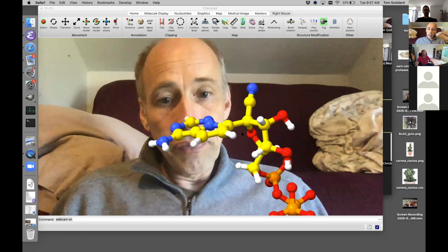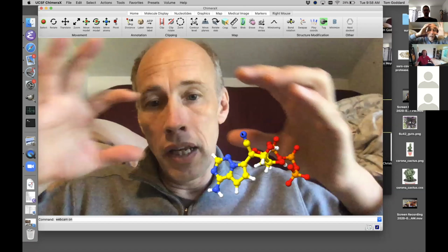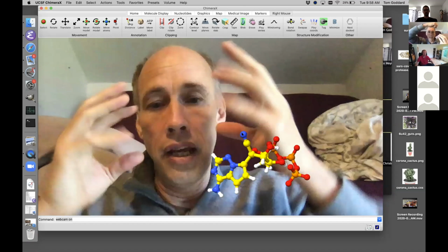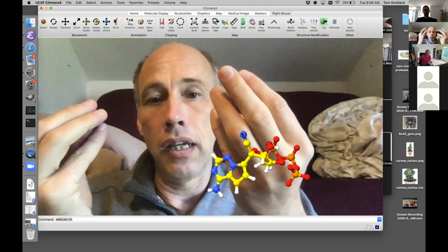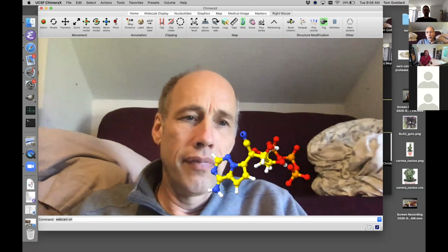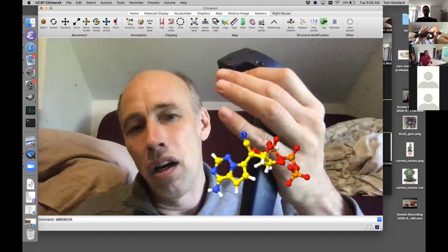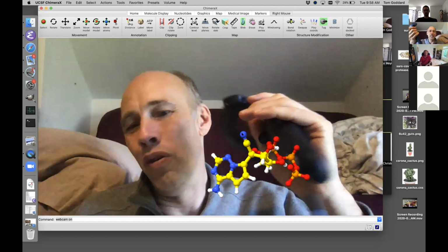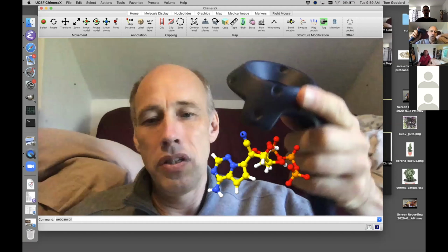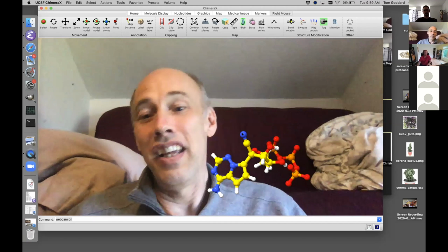And in serious augmented reality equipment, like a Microsoft HoloLens, where you can see through, it's a headset and it projects the images. They do hand tracking based on using cameras on the headset. But all of these hand tracking things are really not quite there yet. And so in VR, the norm is you hold some device in your hands. And the Kinect could work that way too. So we're interested in supporting devices that people actually have, I guess I'd say.